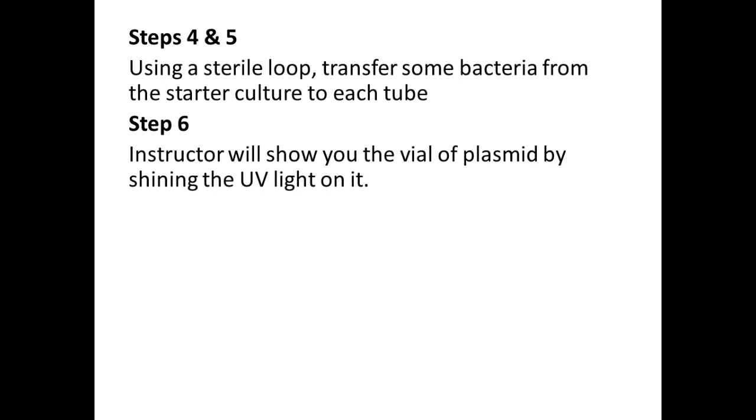Then I'm going to come around and I'm going to show you, and I'm going to shine UV light on a vial that contains the plasmid. What is the plasmid? What type of molecule is it? What are we giving our cells? We're doing transformation today, so what are we giving them? DNA. We're giving them DNA.